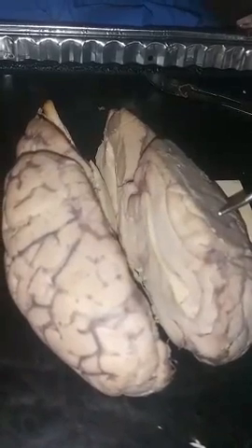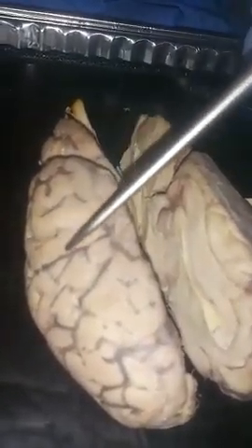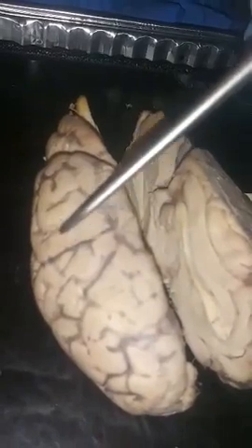Sheep brain dissection. This is the left and the right cerebrum, the two hemispheres divided by the medial longitudinal fissure. That is the largest portion of the mammal brain. The sulcus is located right here. That's a groove between the gyri of the brain. And then the gyrus is located up here, which is one of the folds of the cerebral cortex.